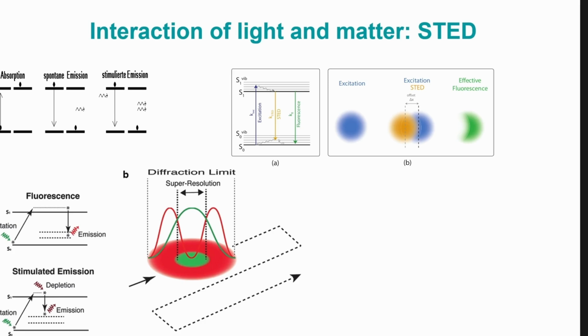But if this is set up properly, then from a laser spot, which is again diffraction limited, I cannot make this orange donut smaller than a couple of hundred nanometers. But what I can do is, if I increase the energy of the orange laser, I can make the spot in the middle smaller. Now, this means that overlapping this, there is a diffraction limited, full-size green laser spot. But the actual excitation of the green laser happens only in the center.